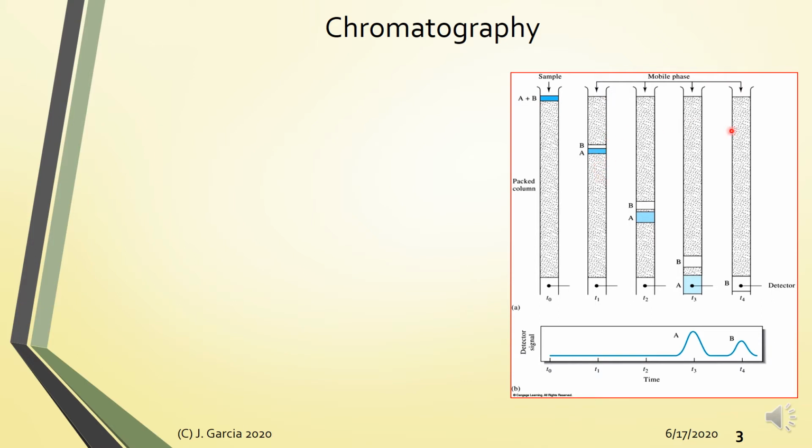So in chromatography, basically you have two phases. The one that is placed inside the column, not always solid, is what you refer to as the stationary phase. And then you have a free-flowing phase you call the mobile phase. As you know by now, the mobile phase can either be a liquid or a gas, whereas the stationary phase can be a solid or a liquid immobilized on a solid support matrix.